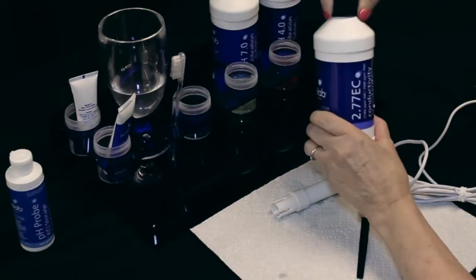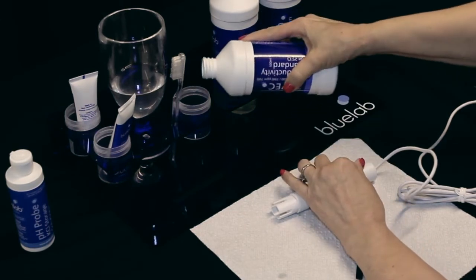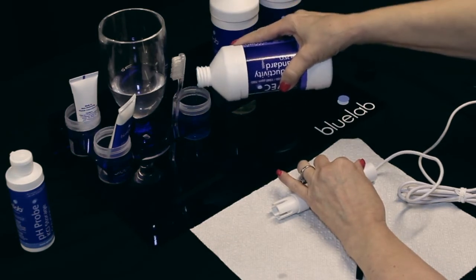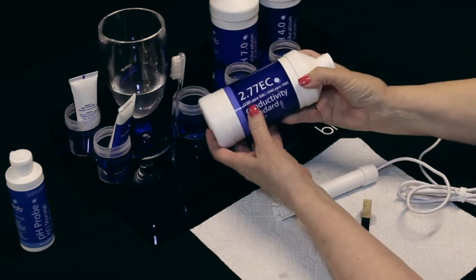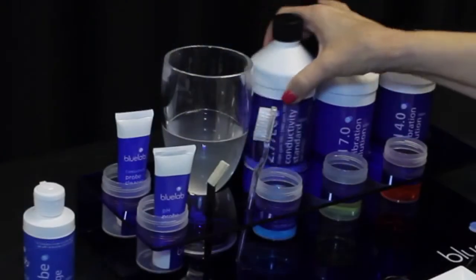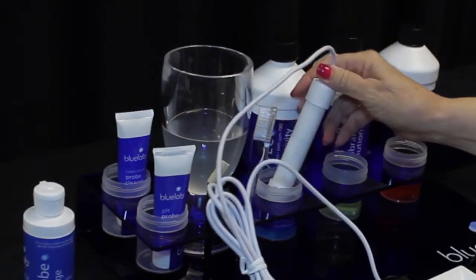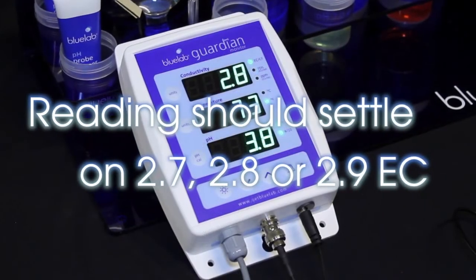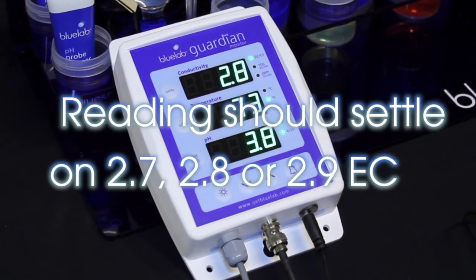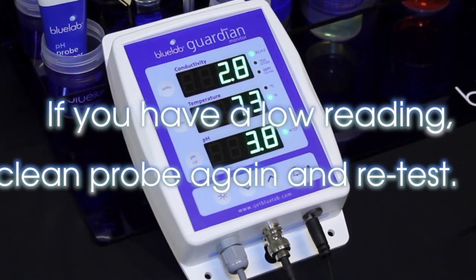Test the probe in a known solution to ensure it is clean. There are many PPM and EC testing solutions on the market. Use Bluelab solutions with Bluelab products to ensure the highest level of accuracy. To test, place the probe in freshly poured Bluelab 2.77 EC conductivity standard solution. Wait a few minutes for it to compensate for temperature. The reading should settle on 2.7, 2.8, or 2.9 EC. If you have a low reading, clean the probe again and retest in fresh solution.